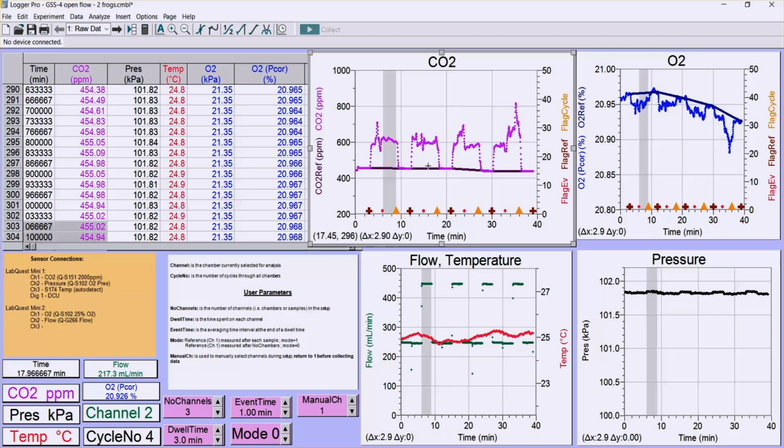We wanted to bring both signals close to similar levels, and we achieved that by having a higher flow rate in chamber 3 or channel 3 with a larger, more active animal. But in actual experiments, we recommend that the animal size is kept similar, so the response time and the response level are similar, so you can have the same flow rate.